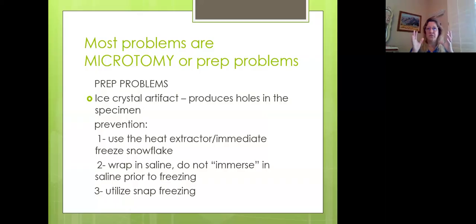Try to educate your people in the OR. Some people will send down a specimen in a fixative and want a frozen on it. Well, we can't really do that because we're talking NBF, and there's a bunch of water in that NBF.